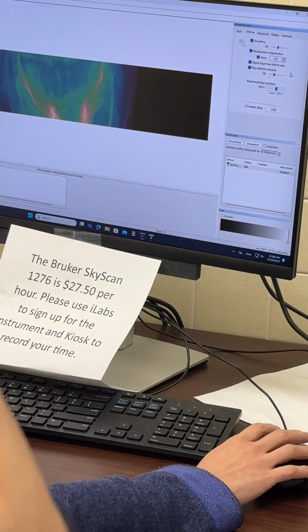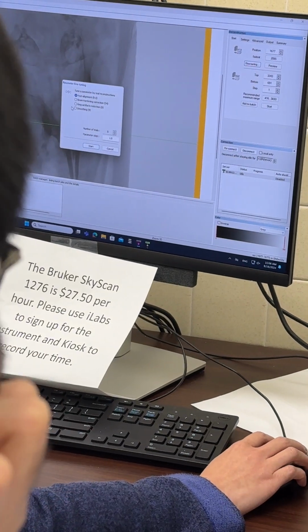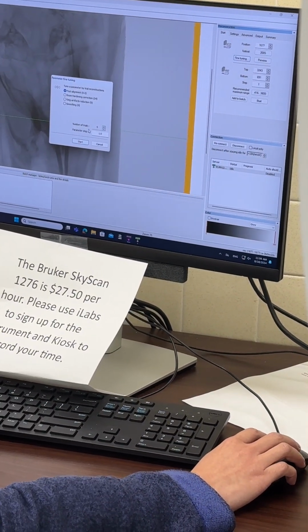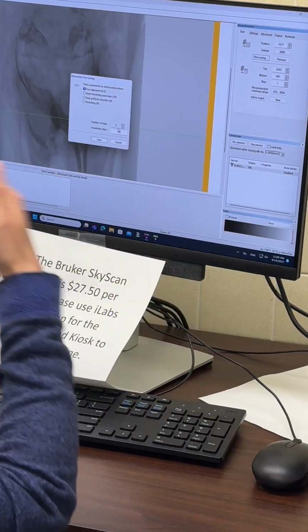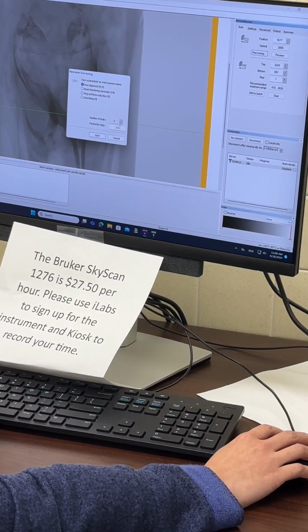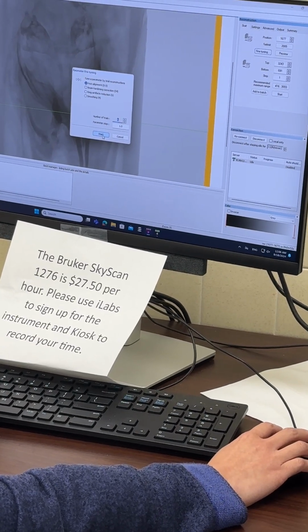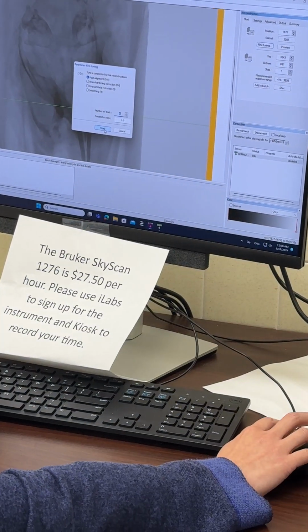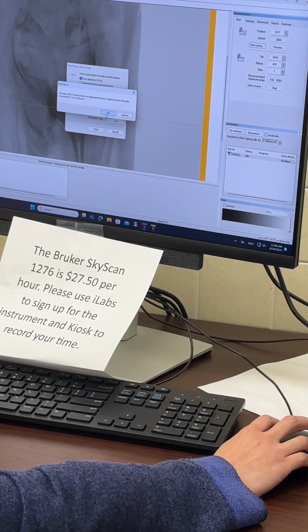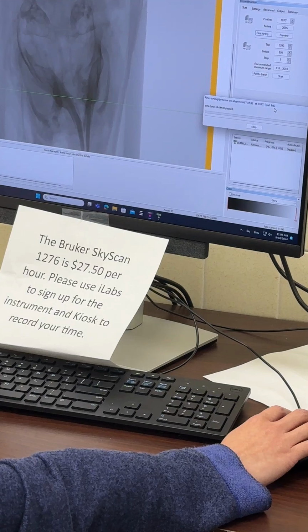Only adjust the misalignment. So we go back to start, fine tuning, choose alignment. So you can change the number of trials, like we test different numbers. Like parameter setting step 1, we can start from 1 first, and then you click start. So the baseline I set as 9. This is our record for the other sample. And then wait for a few seconds to 1 minute.